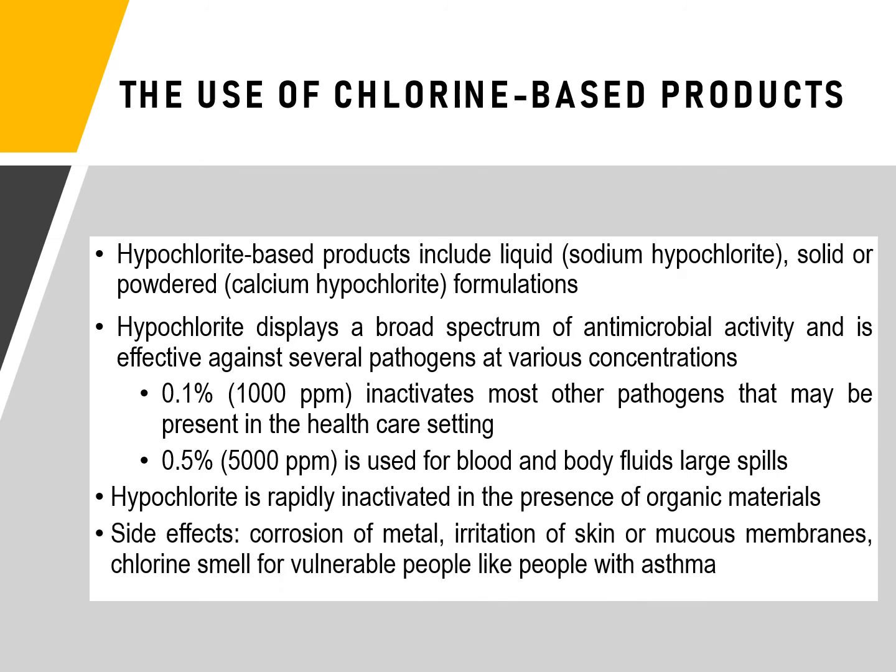Side effects of using chlorine-based products include corrosion of metal, and it can also contribute to skin irritation or mucous membrane irritation, and the smell of chlorine, especially for people with asthma, promotes asthma attack. So if you're going to use hypochlorite during disinfection, you must be wearing personal protective equipment, and that includes your mask.